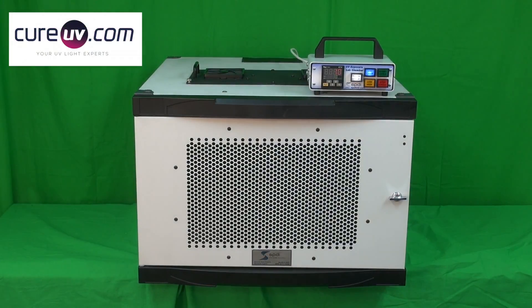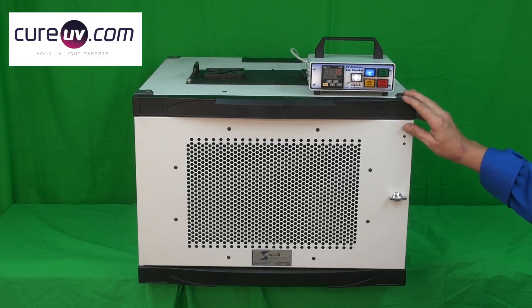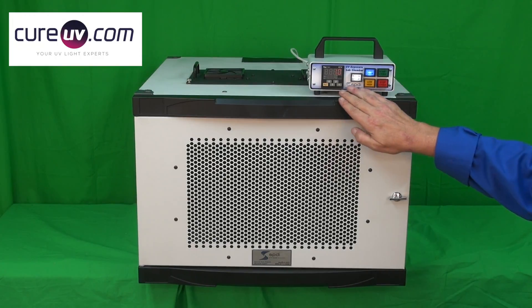SPDI, the UV experts, introducing our proud new member to our UV family of products: our UV exposure lab chamber, high-intensity model.